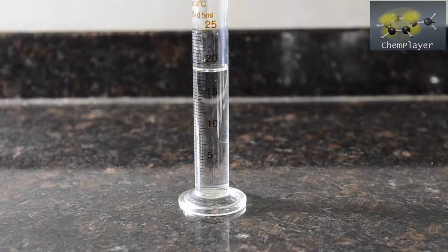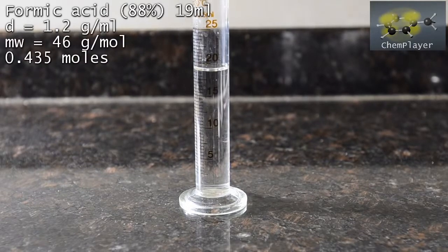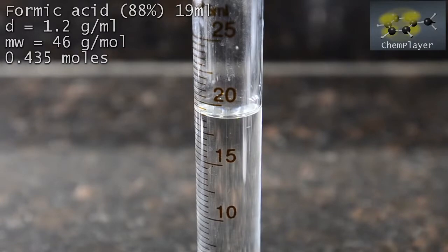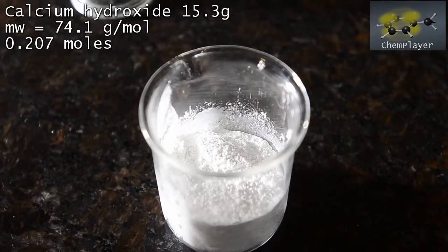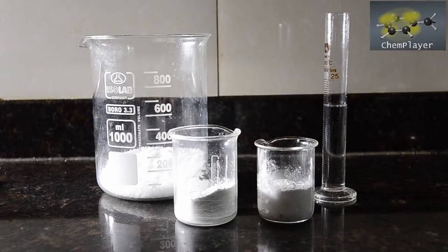We're going to do something a bit different and use formic acid. We've got 19 ml of 88% formic acid solution here. This is an equal molar amount to the benzoic acid. And to convert this to the calcium salt, we've weighed out another portion of 15.3 grams of calcium hydroxide. Here's our reactants. The two carboxylic acids in equal molar amounts, and the corresponding portions of calcium hydroxide to convert them to the calcium salts.